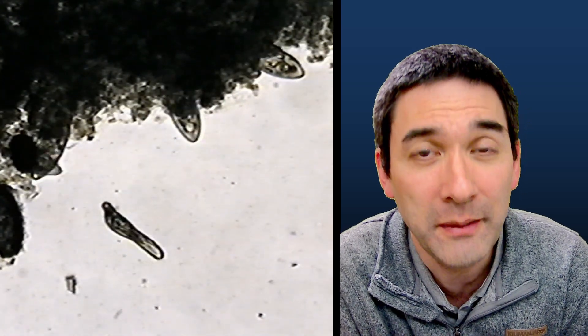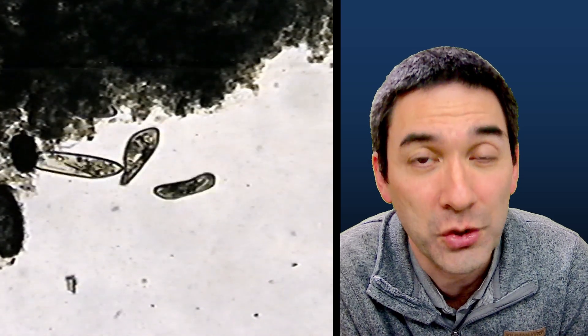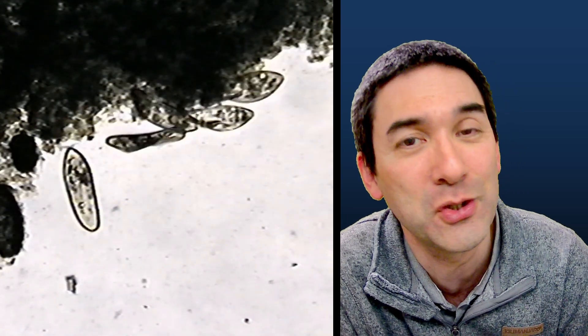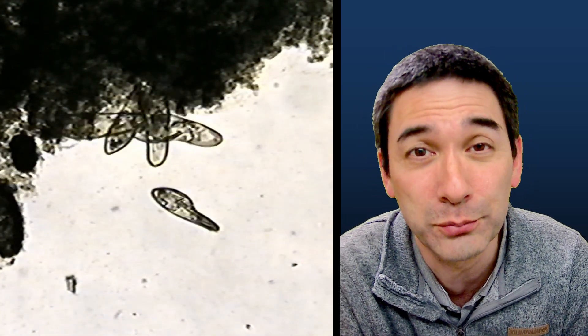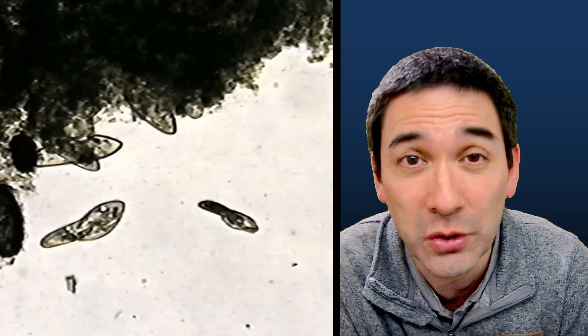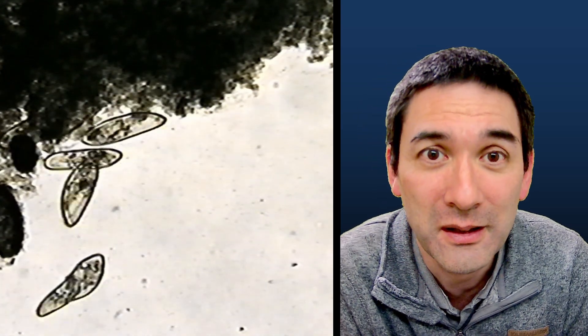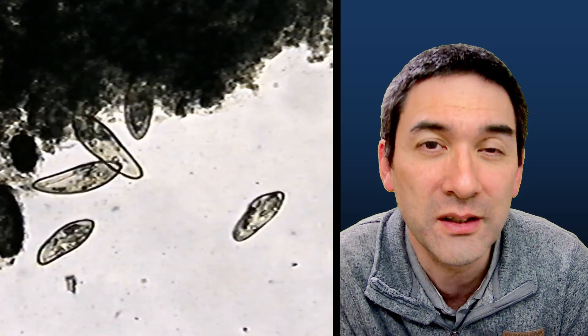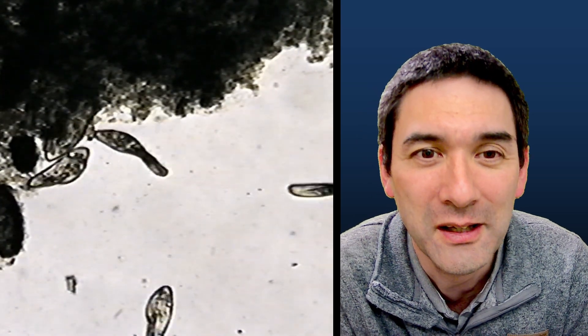This happens by osmosis, and sooner or later the water loss is so extreme that the cells are not able to survive anymore. The salt will also disrupt certain chemical processes in the cells, and then of course the cells will die and they will stop moving as well. When you observe them, you're going to see that they start all of a sudden spinning and moving very quickly, and then they stop moving.